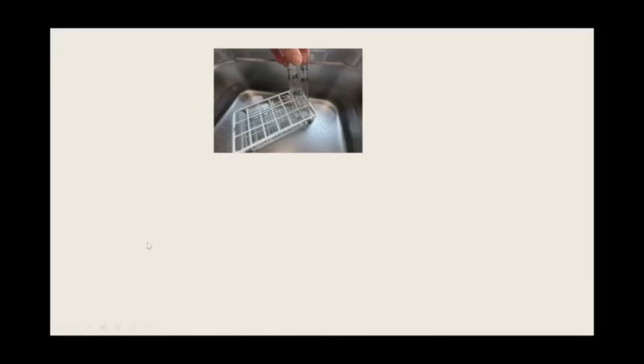Before starting the experiment though, I'm going to get 2 test tubes, one to have a solution of the sugar and yeast, and then a separate solution for the TTC. Place that in the water bath for a minimum of 5 minutes. When the 5 minutes is up, I'm going to come back with a thermometer and check the temperature of the 2 solutions to make sure that they have now reached the temperature of the water bath.